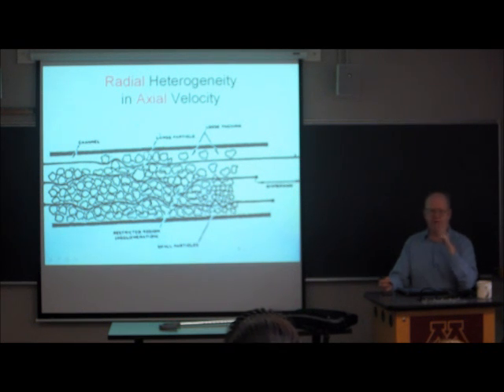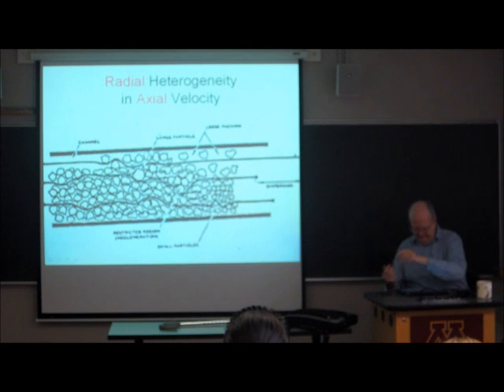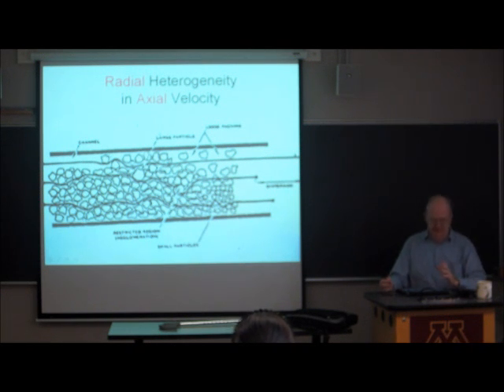The particles are not all locked in register. They're not lined up with one another. There are gaps between particles. All of the particles are not exactly the same size. We strive to make them the same size for various reasons, especially in HPLC, but they're not exactly the same size.